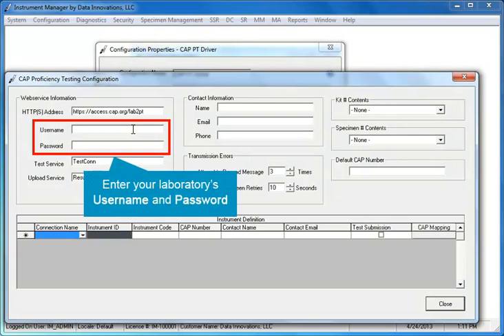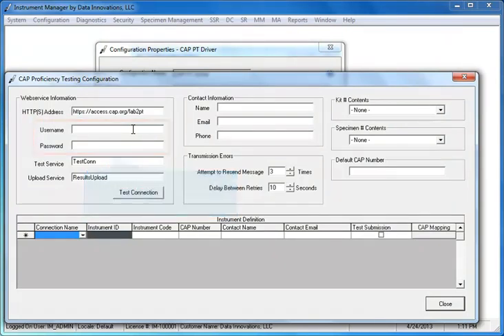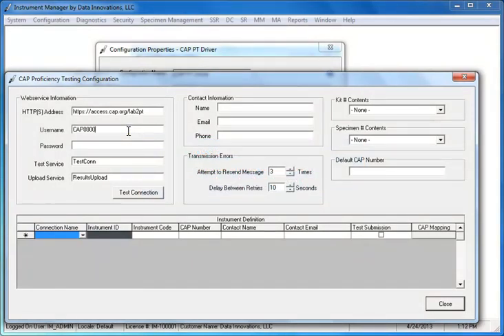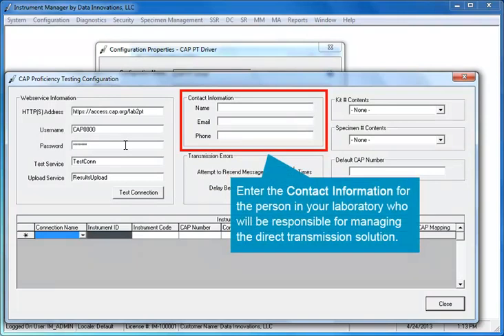Enter the username and password provided to your laboratory by the CAP. If possible, it's a best practice to copy and paste these items from your email rather than typing them manually. Next, enter the contact information for the person in your laboratory who will be responsible for managing the direct transmission solution.